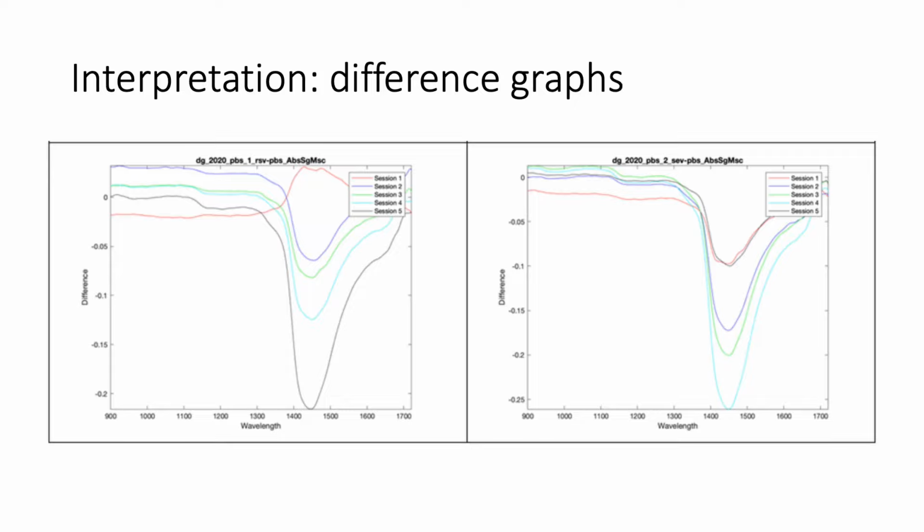This paper reports findings from one study, which is part of a funded project. In this project, we study NIR spectral characteristics of respiratory viruses and design the data analysis pipeline in order to build spectroscopic virus detection models. Ultimately, our aim is to build a spectrometer-fronted cloud-based system for in situ virus detection, which can record spectra from patient samples and then quickly return the positive or negative result.